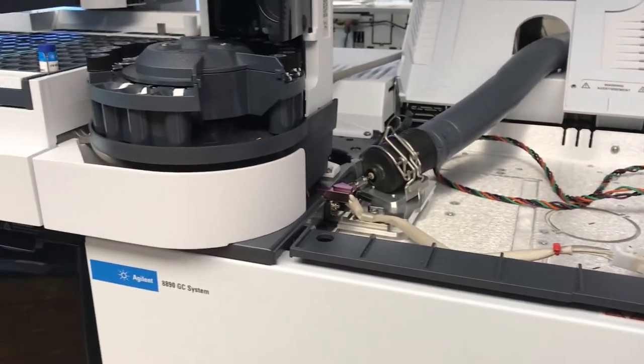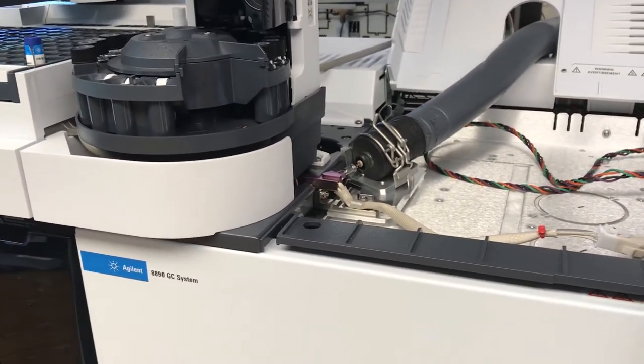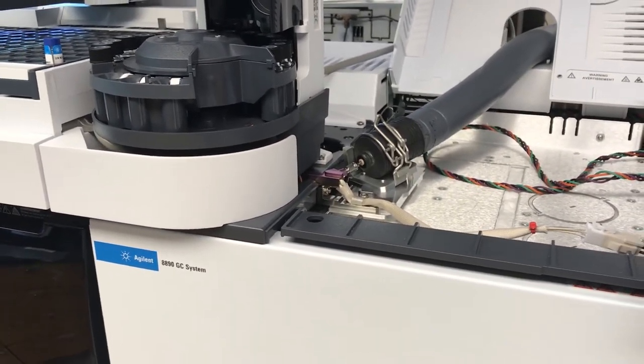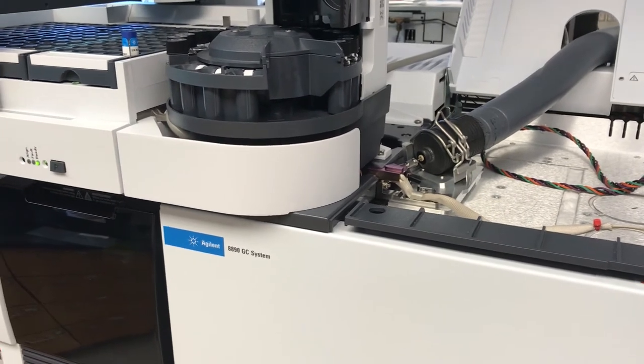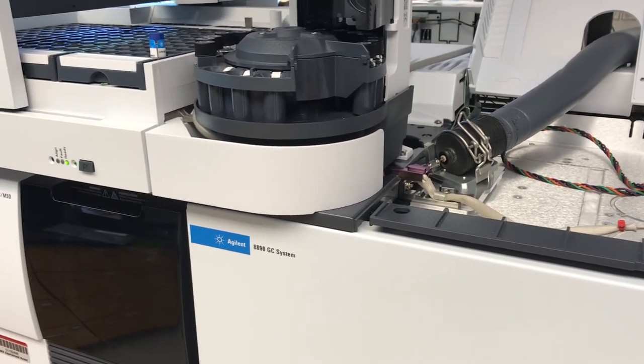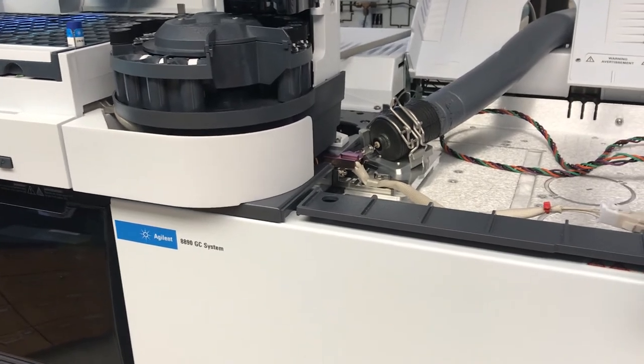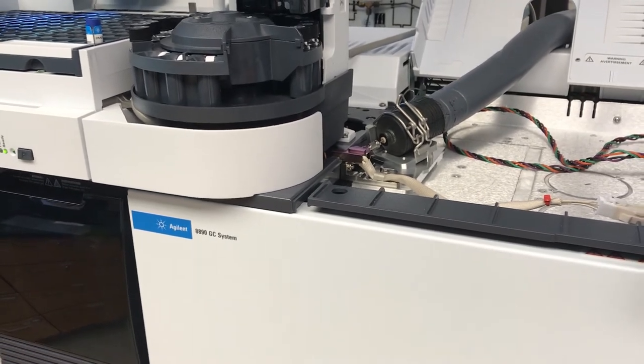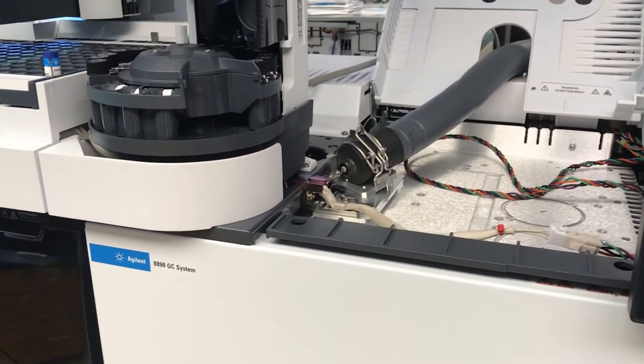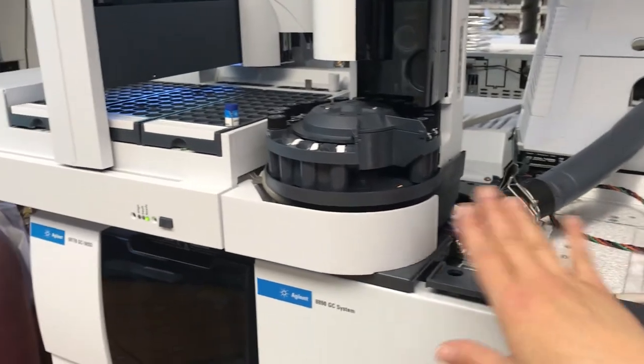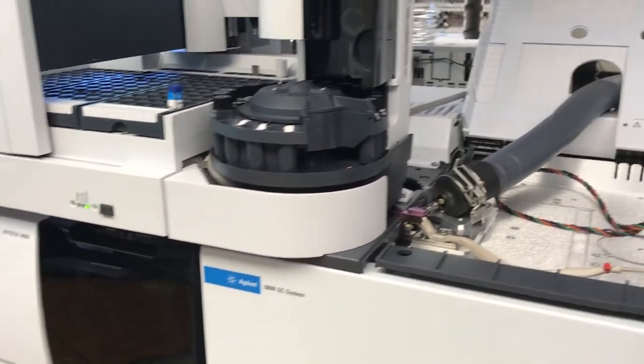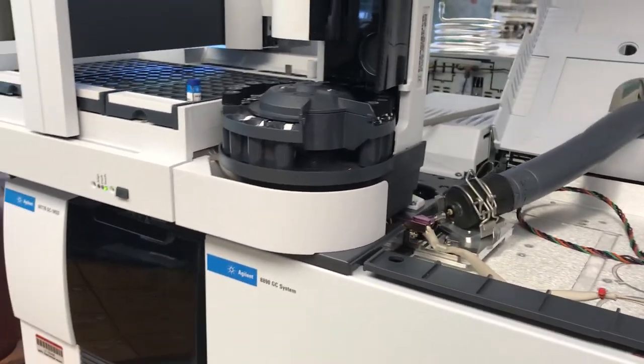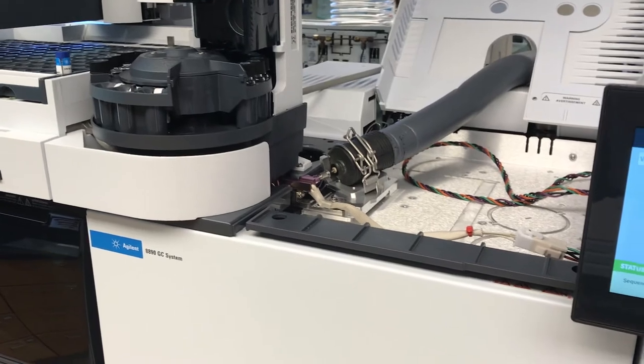So we can't run headspace and liquid samples simultaneously or within the same method or sequence. But we don't have to worry about switching out the inlet ports and things like that. So it's a really nice setup now.